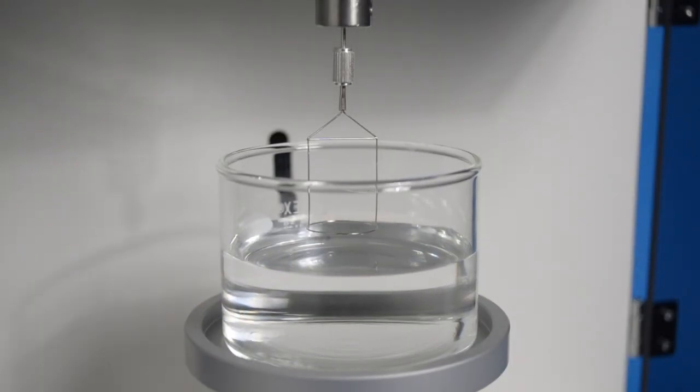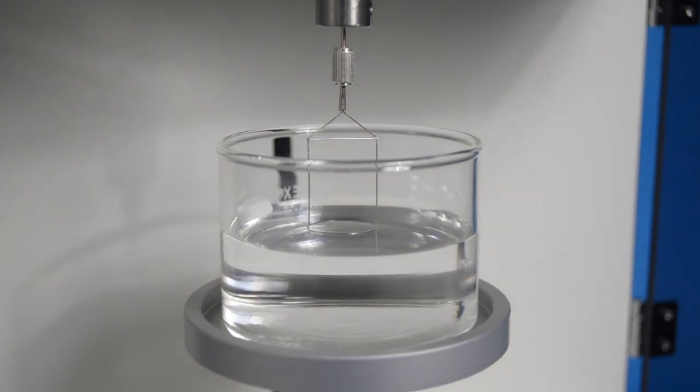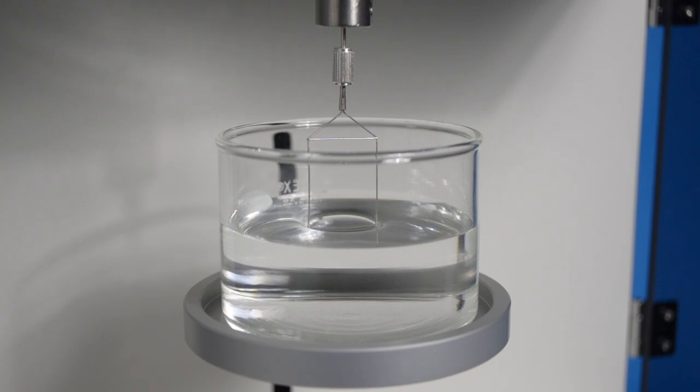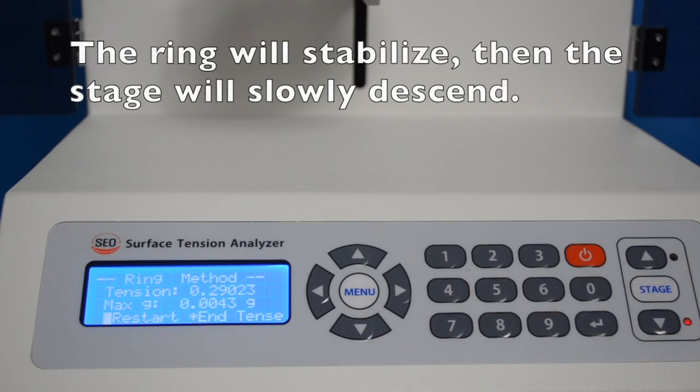With this, the instrument automatically moves the stage up so that the sample passes up through the ring and the ring is totally submerged. At this point, the ring becomes stabilized in the sample.